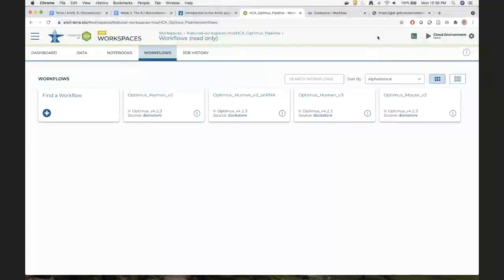Yeah, so that's great, and it's a little bit evolving. It used to be, say a month ago, that the runtime was common across all of these workspaces. So the cloud environment over in this featured workspace would be the same as in your pop-up workspace, but the runtimes are being aligned with workspaces.